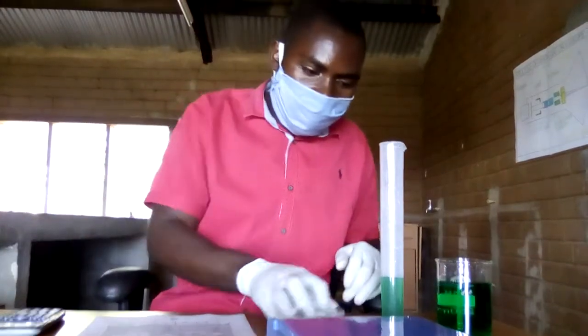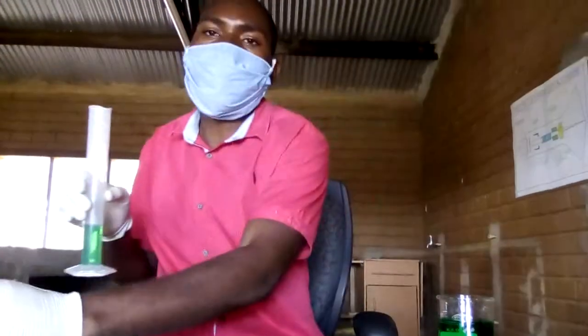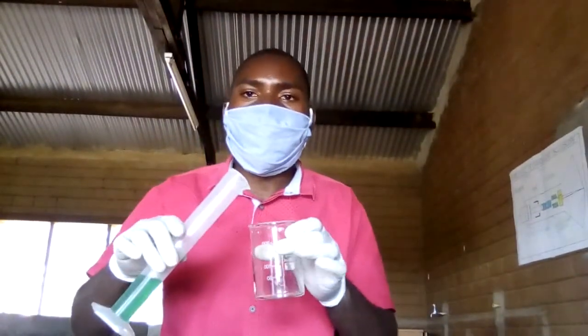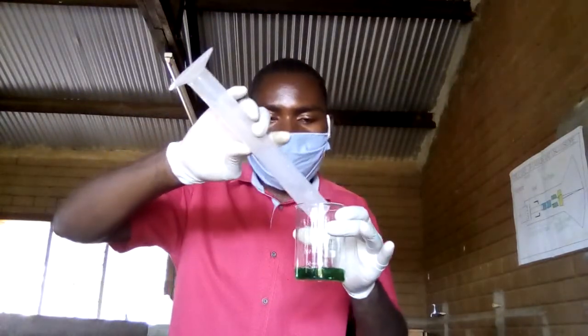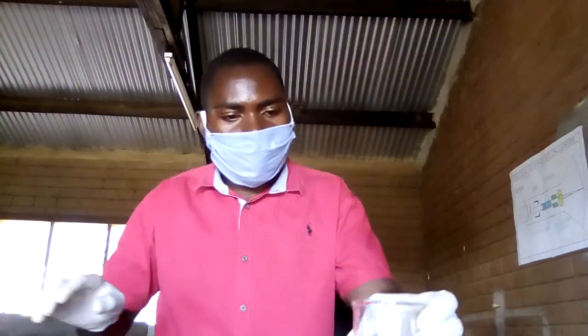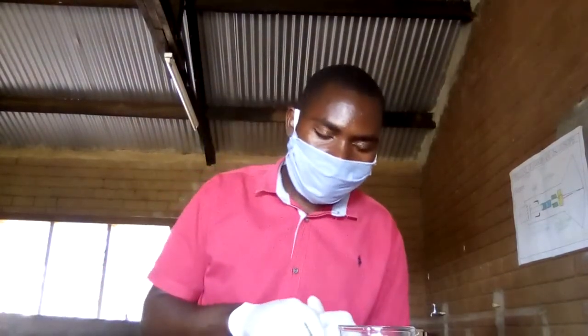I've measured the volume, and as usual, you need to transfer this information into the empty beaker. So I'll pour it into the empty beaker, and then I need to measure the mass. So it is 131.6. Then subtract from this number 102.1. So the answer you get should give you about 30 grams.